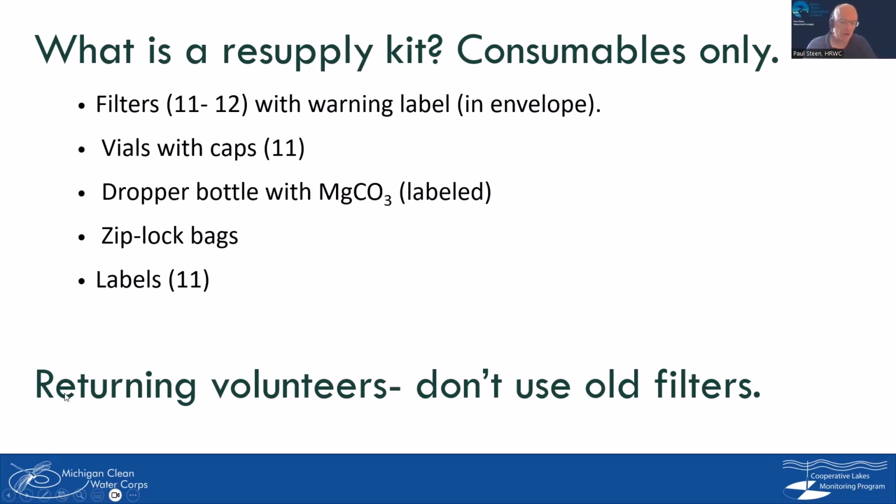So oftentimes that's what you want. Now, it's also important to note that returning volunteers, if this is you, don't use old filters. Throw out filters at the end of the year that you haven't used. You'll see we often give extras in case you drop one or lose one. That means some people over the course of 5 years save up enough to actually use them for the next year, which we don't want you to do, because filter technology is changing, or we're changing suppliers.